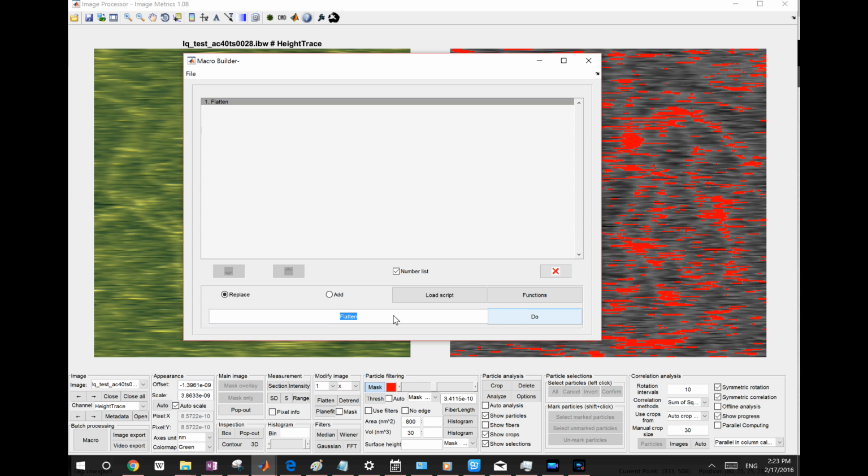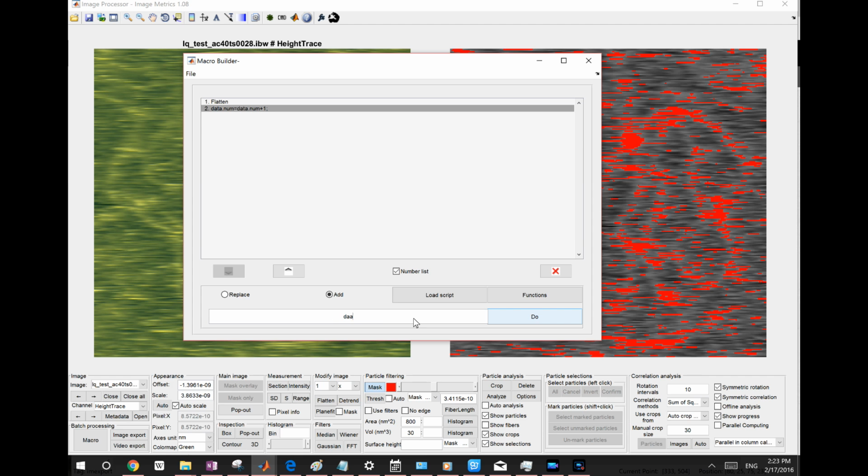You may also wish to count the images, so you can store the variable in your structure variable called data, and each time you run the script, you say data dot number of images equals, let's see, so basically it has to increase every time. So maybe I should use something like +1. That probably would suffice. And let's click add script. I probably need to specify the initial value for this first. Let's say 0 in the beginning.